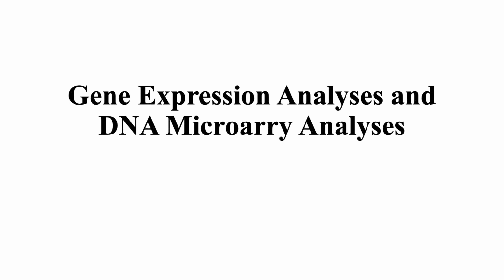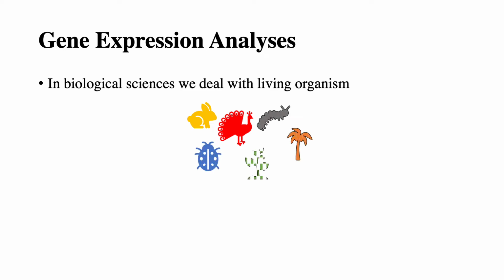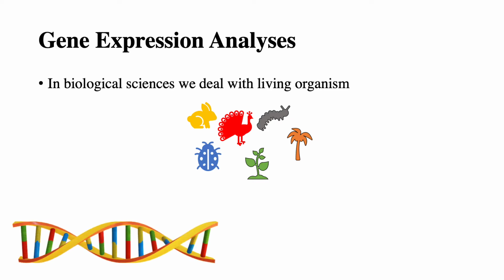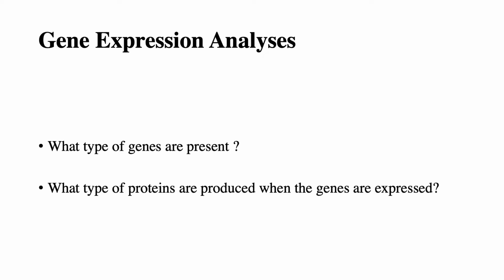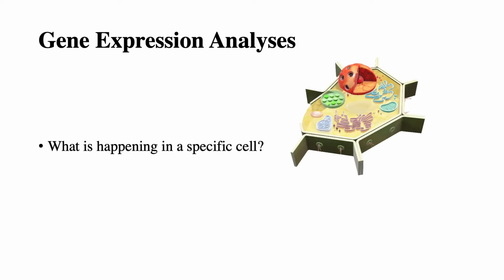In this video, we will learn about gene expression and DNA microarray analysis. In biological sciences, we mainly deal with living organisms, and the key to understanding a living organism is to understand the expression of its genome. Further, we should also know what types of genes are present and what types of proteins are produced when the genes are expressed.